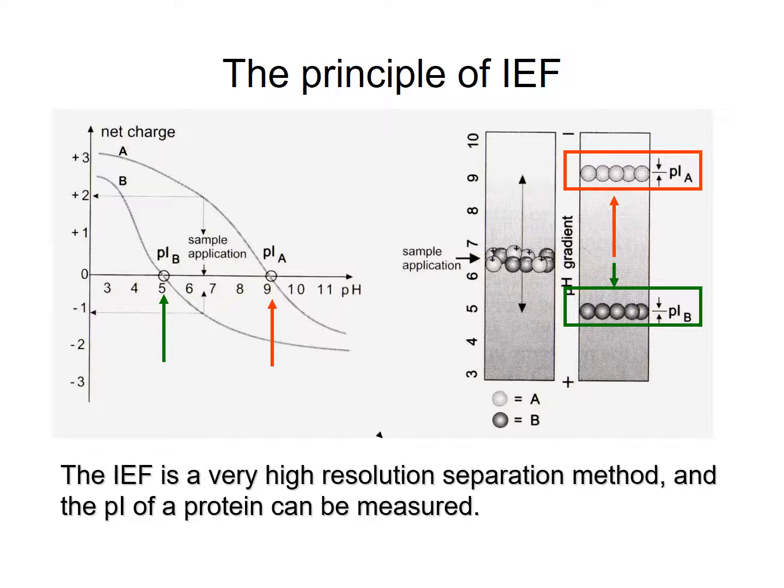So bioinformatics software, so any protein, and you may have done that in your reports, you can predict the isoelectric point, the pI of proteins, and determine the difference there.